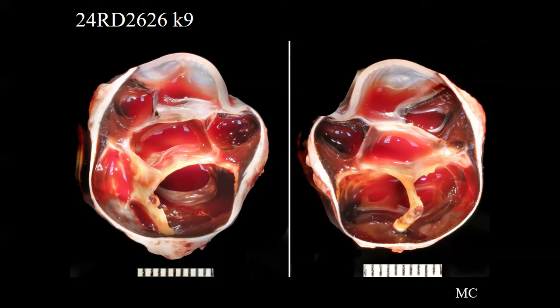So what we have here are the two halves of the globe. That's why it kind of looks like it's a reflection of itself. And with optic nerve heads, there can be only one. However, there kind of seem to be two here. So this is the real optic nerve head, and we have the retina coming out as a detached retina here. And this is not optic nerve head. This is the second half.